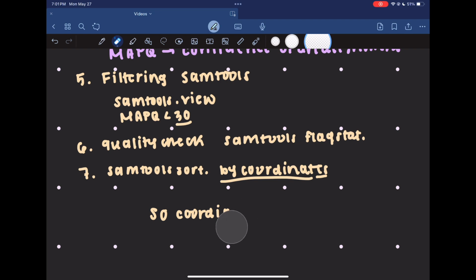But I'm not so sure about RNA star. So it never hurts to just run it. Again, it's a very, very quick process. All of the SAM Tools programs are taking less than 5 minutes on my MacBook. So especially if you have a more high-powered computer to run it on, you'll be totally fine to just run the sort and confirm that it was sorted by the coordinates.